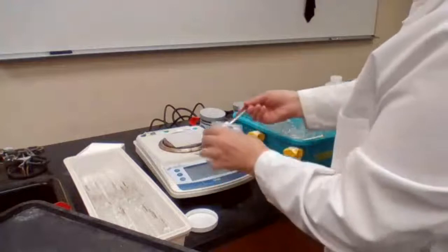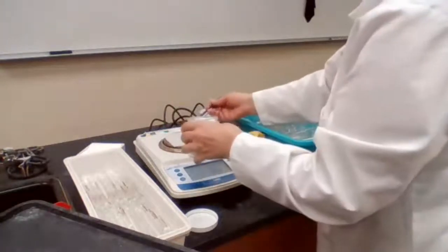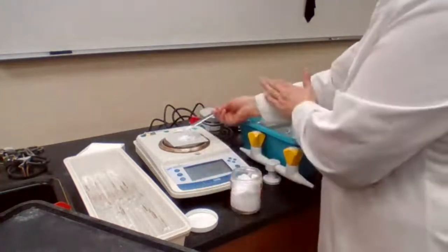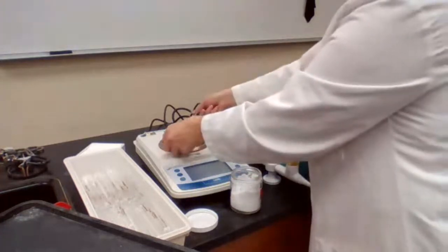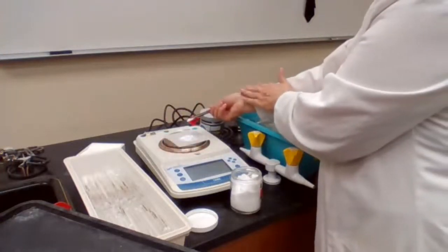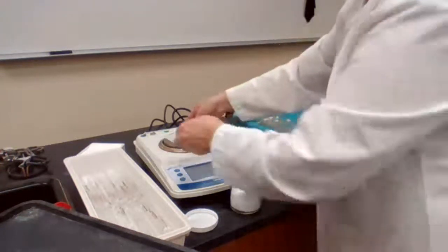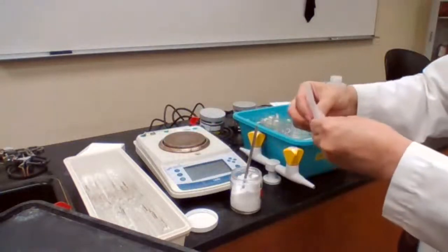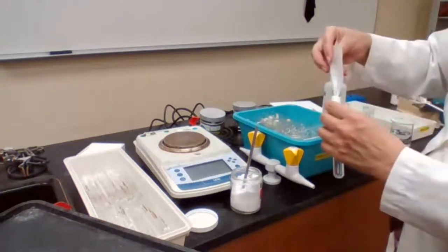I need 4 grams for the second one. I'm going to add the 4 grams to test tube number 2. For test tube number 2, adding 4 grams.